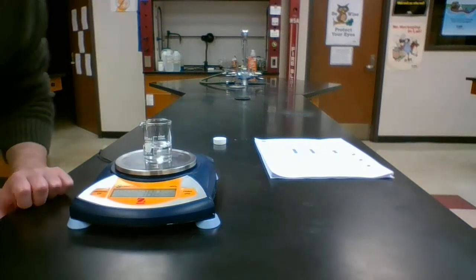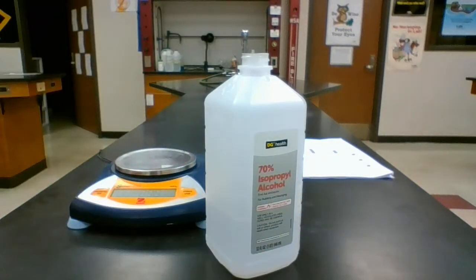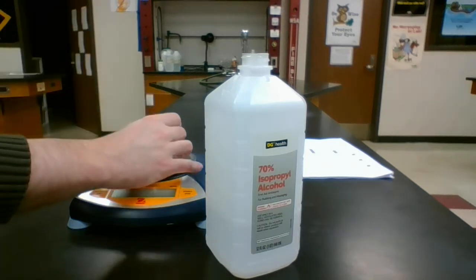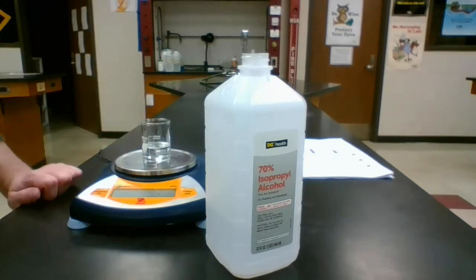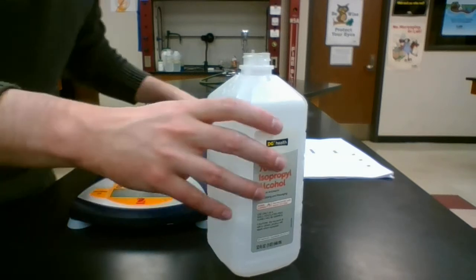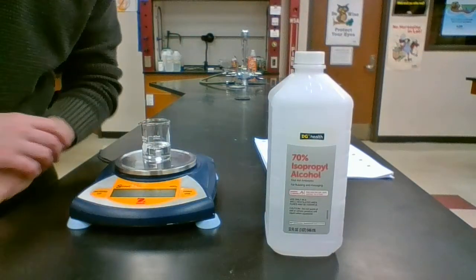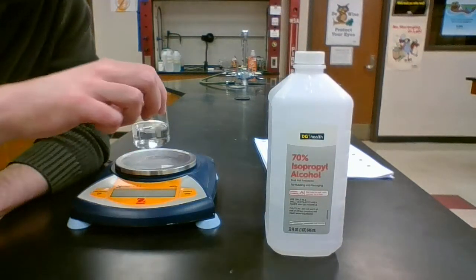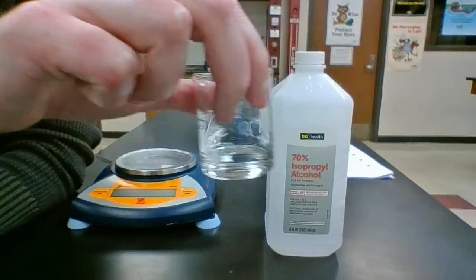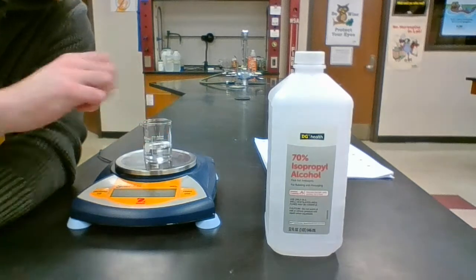Okay, it's a little bit over. I'm going to pour a little bit out. That's a little better. All right. Okay, now, as this is in the beaker, you can really tell this all just kind of looks like water. So you can figure out whether it's a heterogeneous or a homogeneous mixture.